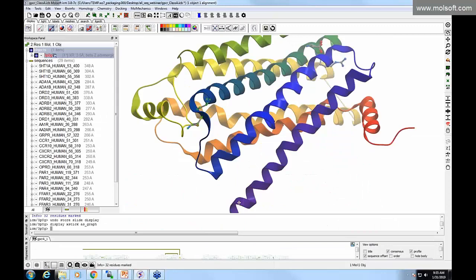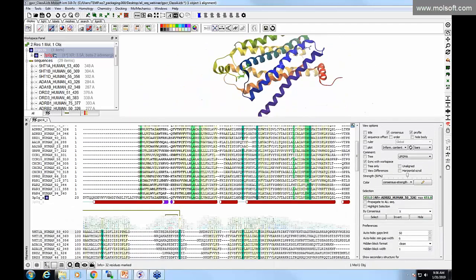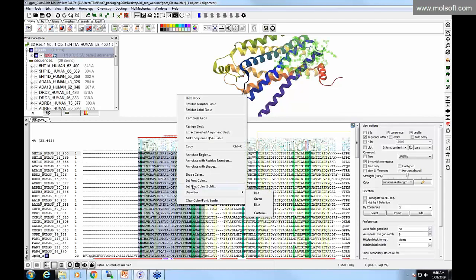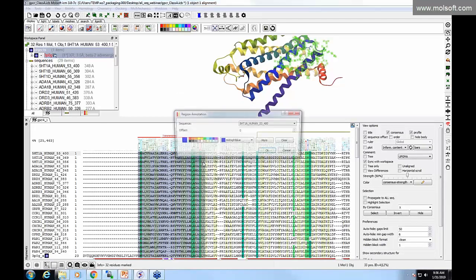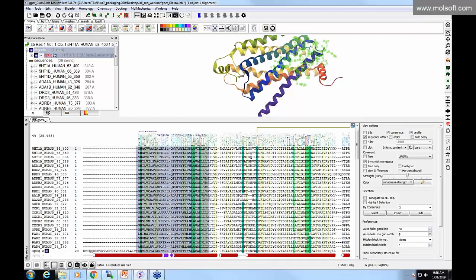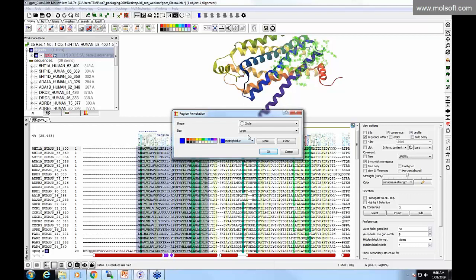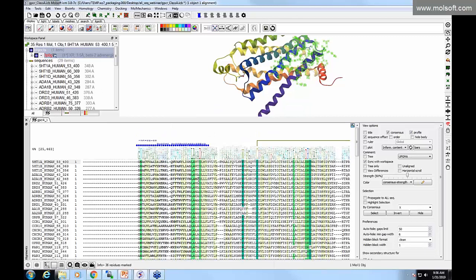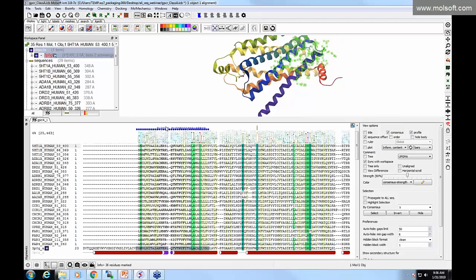So we selected the disulfides. We can also annotate in other ways. I showed earlier that you can add transmembrane, you can add your own text, but you can also annotate an alignment by residue numbers. It gives the residue numbers for each one at this level. You can also annotate using shapes, sometimes useful for a figure. Okay, so you can see here it has these options.